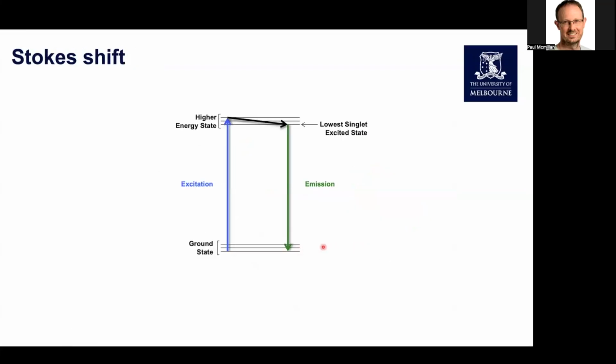Again, if we go back to the Jablonski diagram, in this case I've color-coded it by wavelength. This molecule here, which is probably something like a green fluorescent protein, we need to excite with a photon with a blue wavelength, something in the high 400s nanometer range. So the electrons in this molecule will go from the ground state up to the excited state.